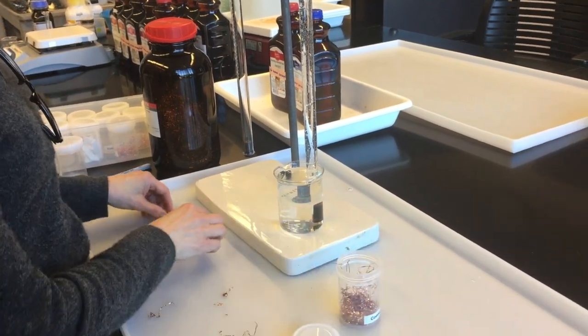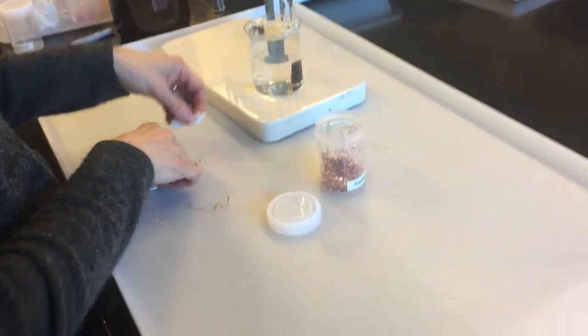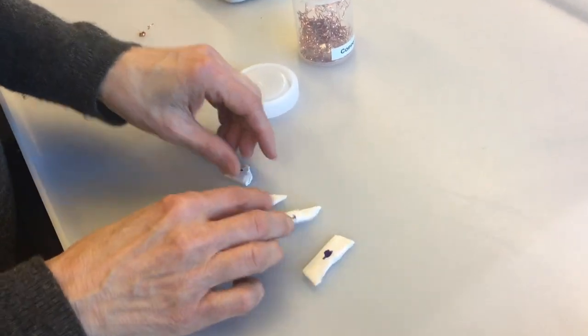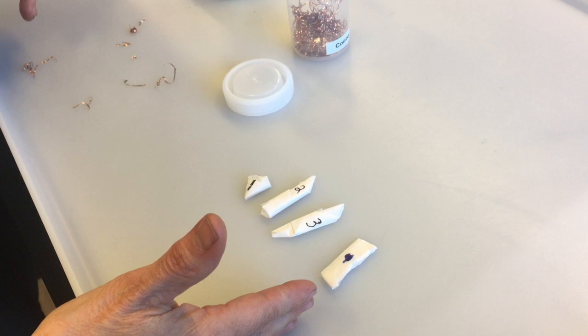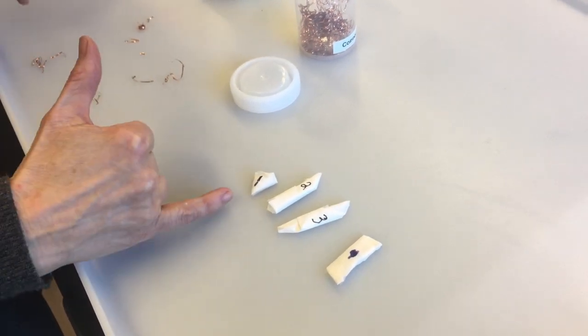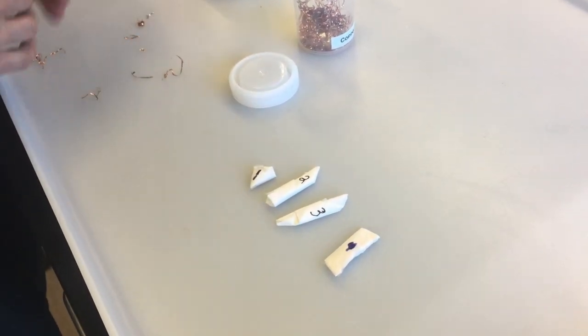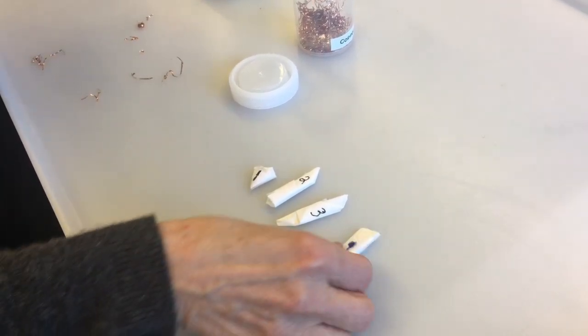First thing you have to do is pick a piece of magnesium from your table. Because the experiment is comparing the size of magnesium to the amount of hydrogen gas produced, there are four different sizes of magnesium at the table. So I'm going to pick the four.